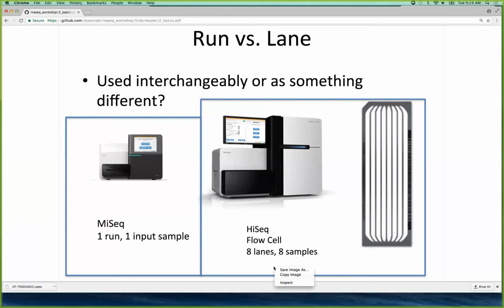Right, so when you come talk to your resident bioinformatician, and she says you need like 50 samples, and then you're like, oh no, I can't afford that. This is the ongoing debate. And I think I talk a whole bunch more about this tomorrow. I mean, but we can talk about it now. Library prep is still a huge bottleneck.